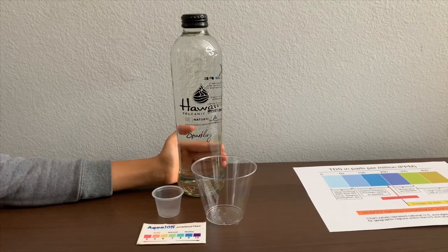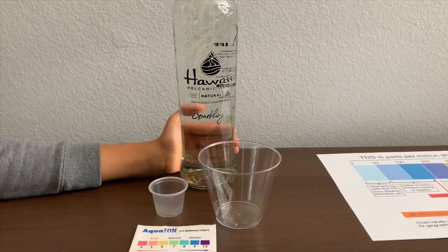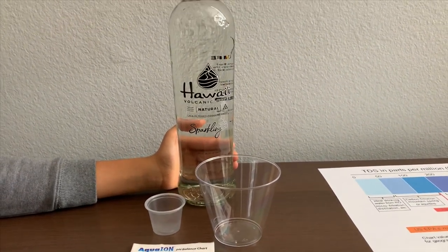This is Hawaii Volcanic Water, Natural Lava Filter Drinking Water. This is the sparkling version, and it costs $4.99.